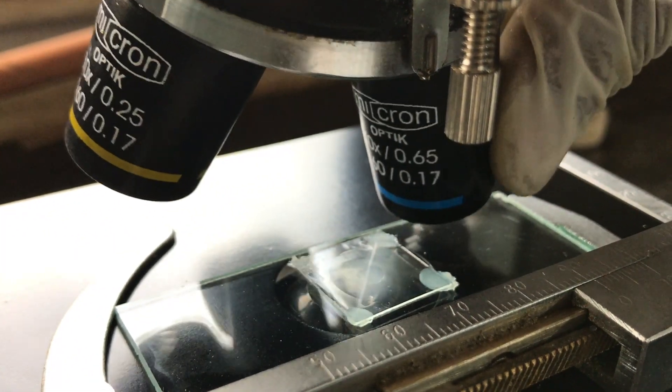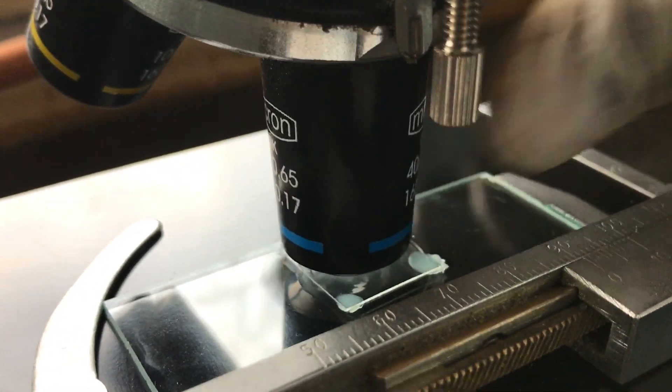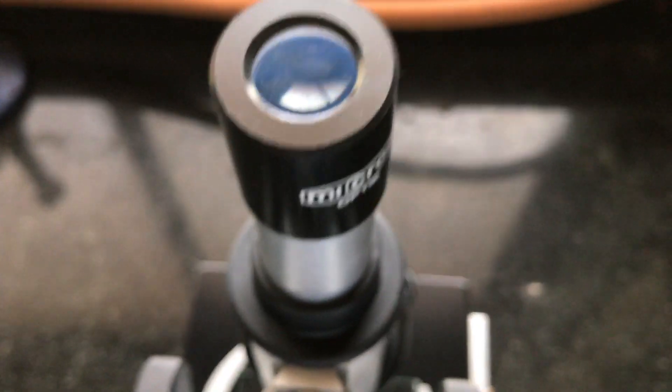High power objective of the microscope, and now we are going to see and dive into the world of gut bacteria.